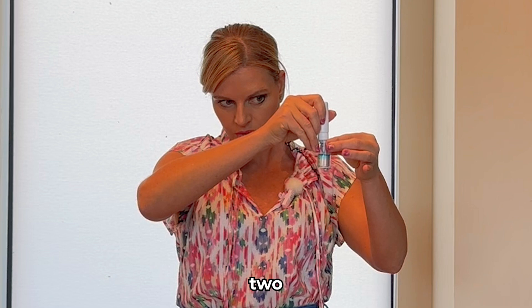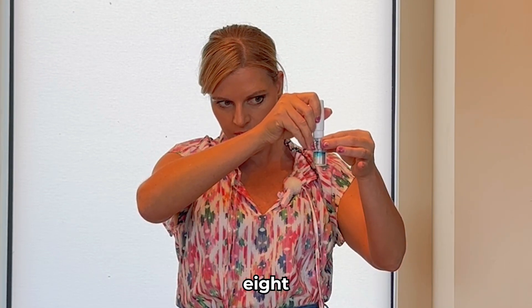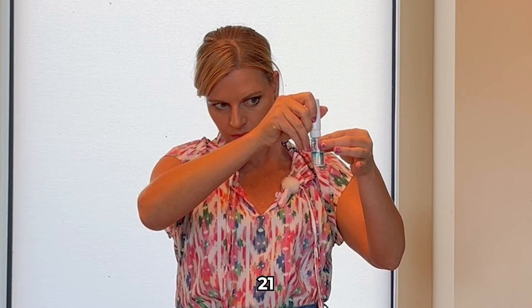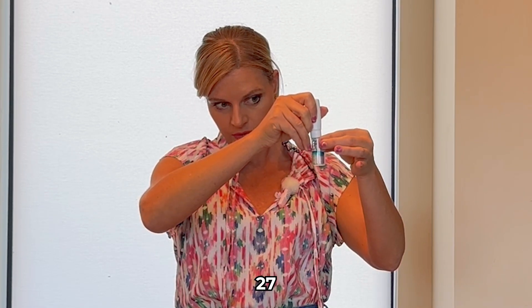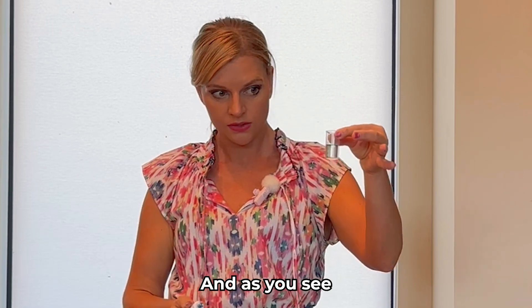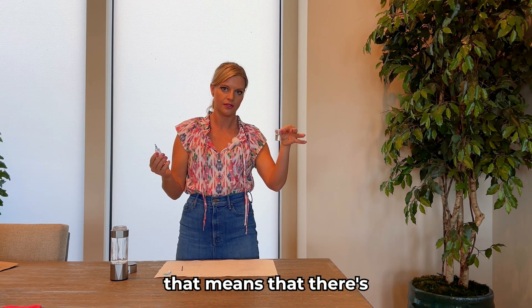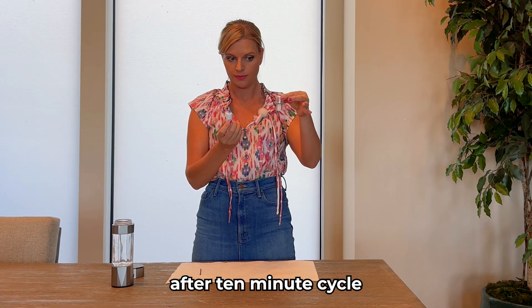Counting out 30 drops carefully into the vial... 1, 2, 3... through to 30. As you can see, it's clear — that's great. If it turns blue, that means there's no hydrogen. But there's at least 3.0 parts per million here after the 10-minute cycle.